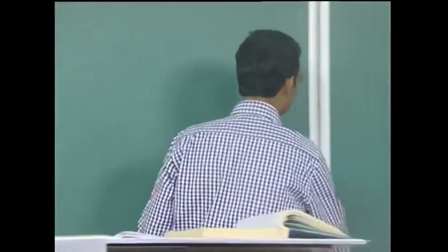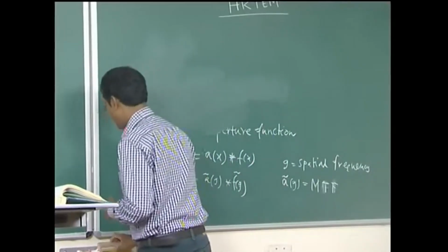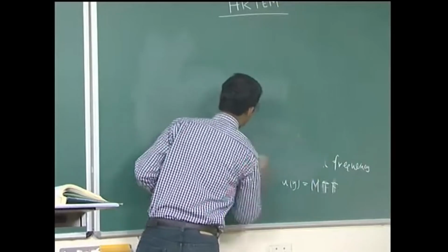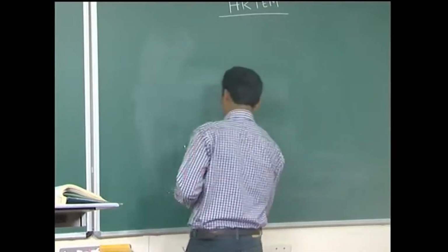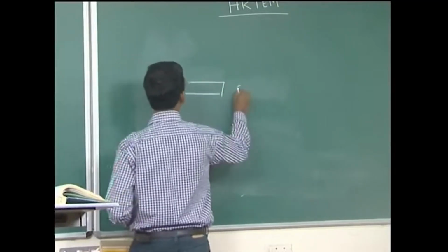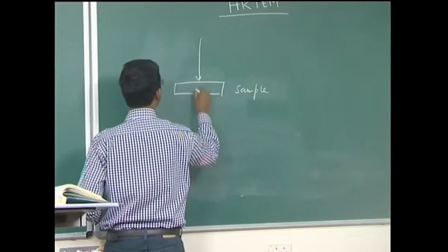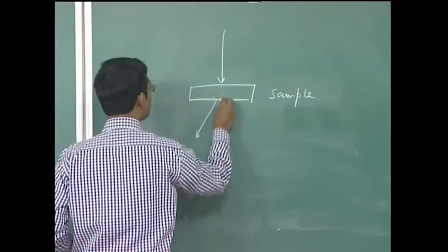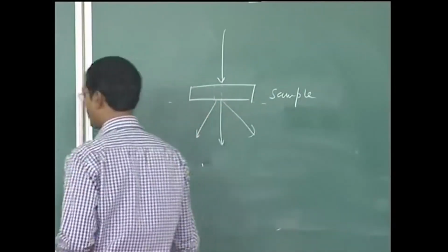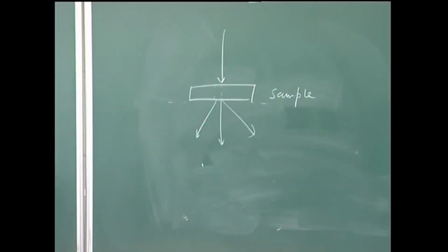If you think of a sample in the electron microscope, we know that the electron beam falls on the sample and passes through it, because it is very thin. So, this is the sample, and the electron beam falls like this and interacts, and then either gets diffracted or not diffracted through this exit plane. This is what happens in the electron microscope, as I discussed with you in the class before.